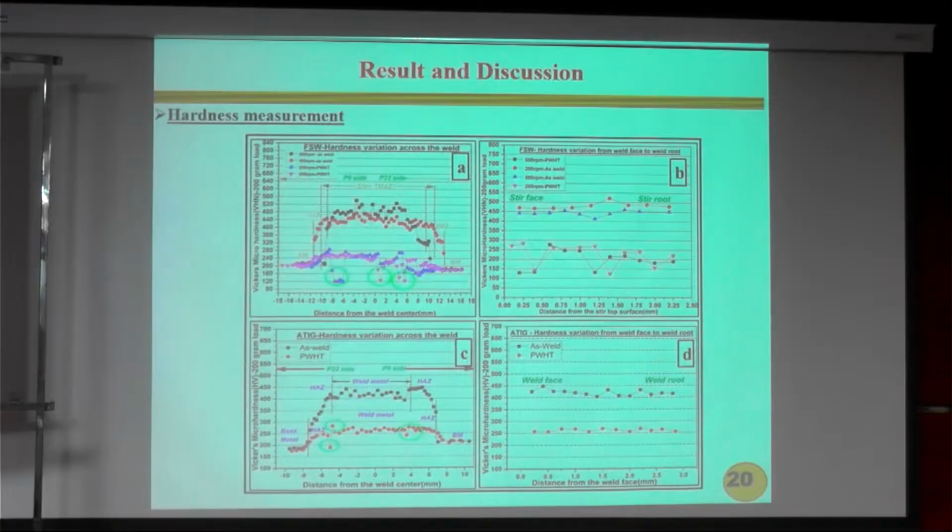But with heat treatment, what happened? Because of the difference in the chromium content, an interdiffusion happens. There is a soft zone and hard zone forming. Because of the soft zone and the hard zone, we can notice this kind of sudden abrupt change in the hardness profile, up and down. This is not favorable for the engineering application.